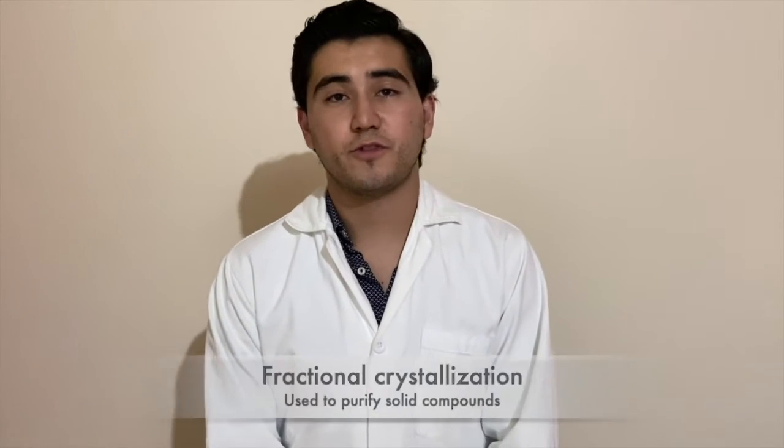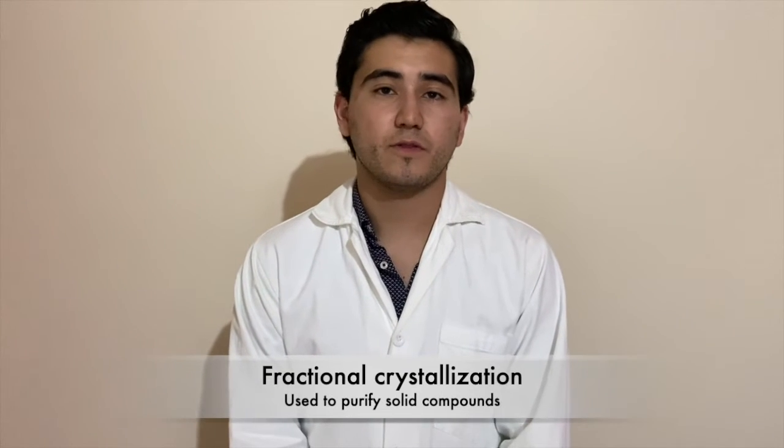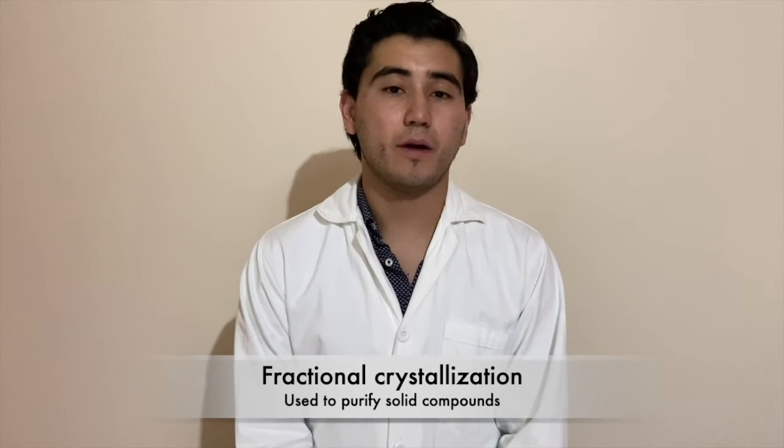Recrystallization is also known as fractional crystallization. It's a procedure for purifying an impure compound in a solvent. Recrystallization is based on principles of solubility. Compounds, solutes, tend to be more soluble in hot liquids, solvents, than they are in cold liquids. If a saturated hot solution is allowed to cool, the solute is no longer soluble in the solvent and forms crystals of pure compound. Impurities are excluded from the growing crystals, and the pure solid crystals can be separated from the dissolved impurities by filtration.